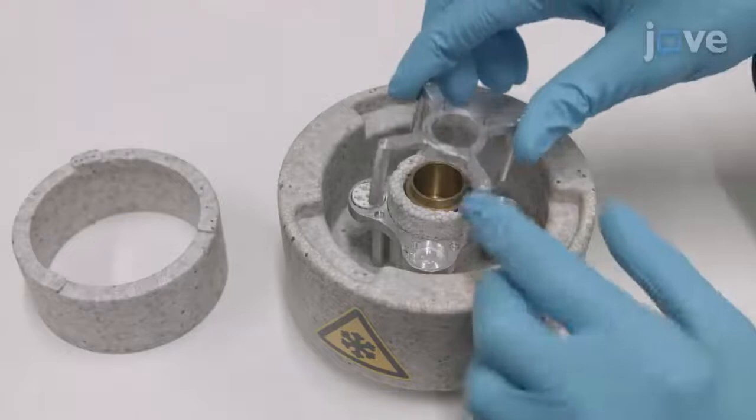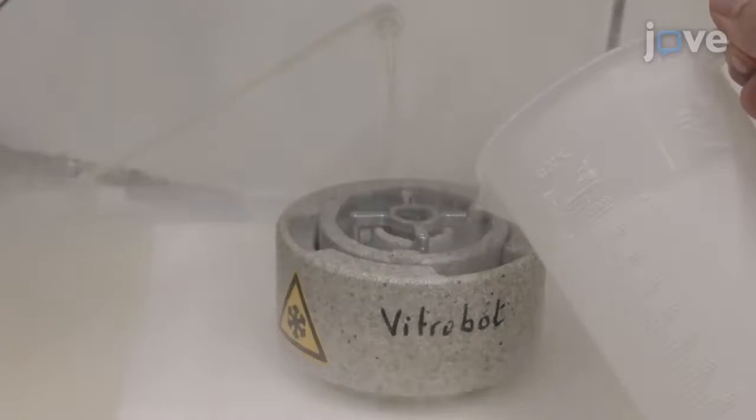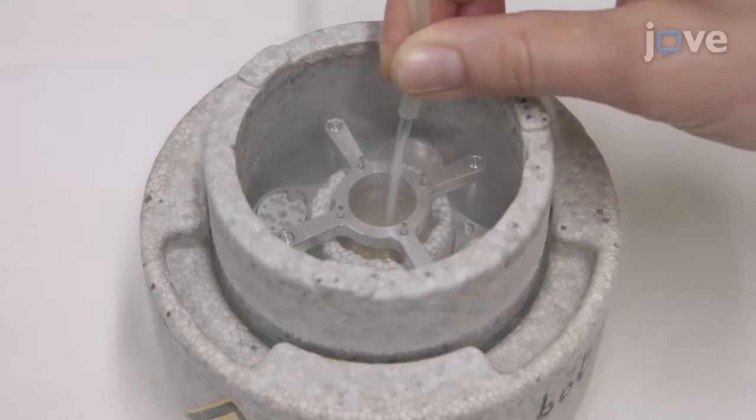Next, assemble the ethane cup cryobox holder and spider and fill the cryogen container to the brim with liquid nitrogen. After a few minutes, the cup will be cool and free of liquid nitrogen. Then open the ethane gas bottle and slowly let the gas stream into the ethane cup. Let the cup fill with liquid ethane until the level is 2-3mm below the top. This will take a few minutes and requires about 5ml of liquid ethane.